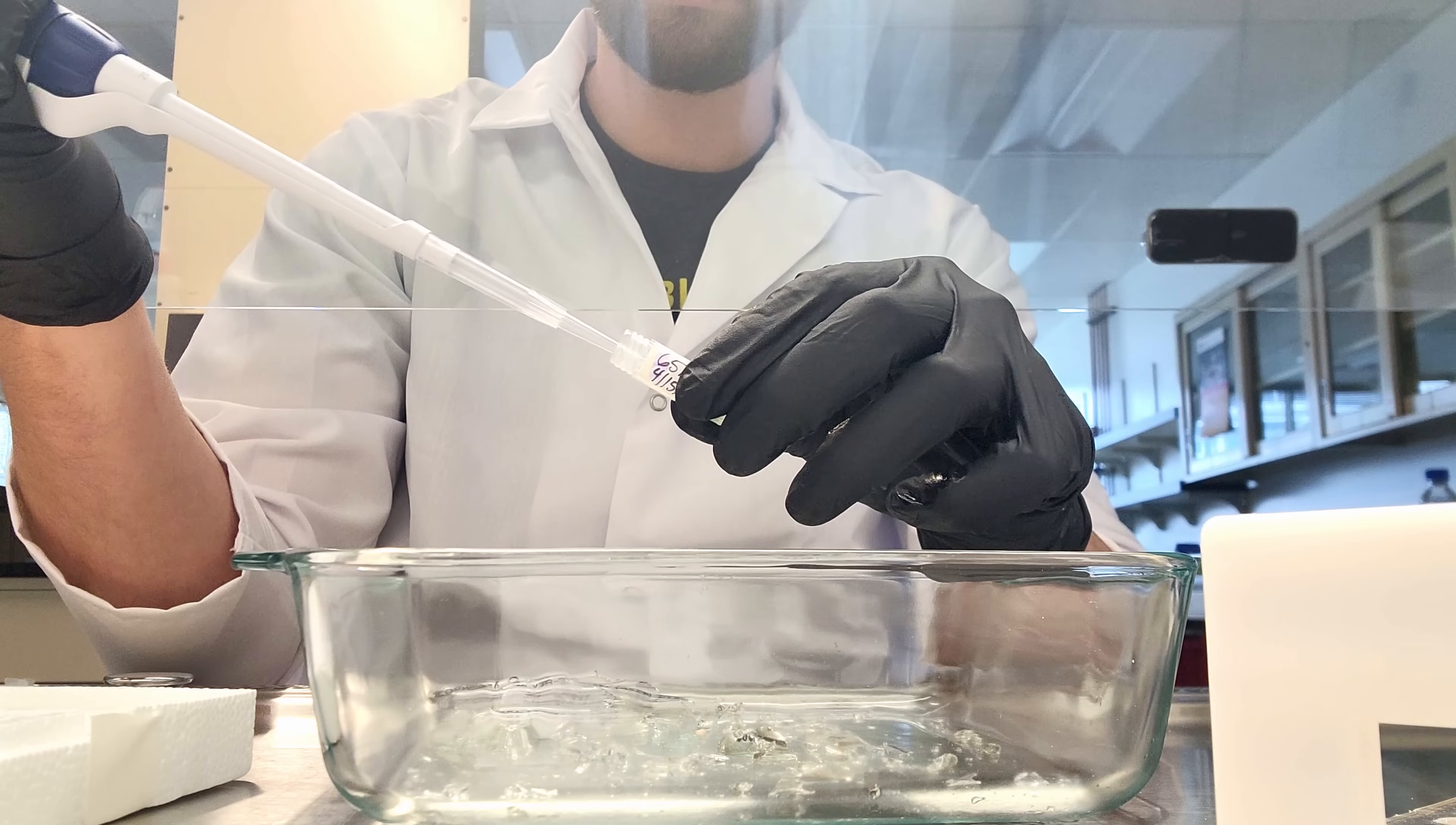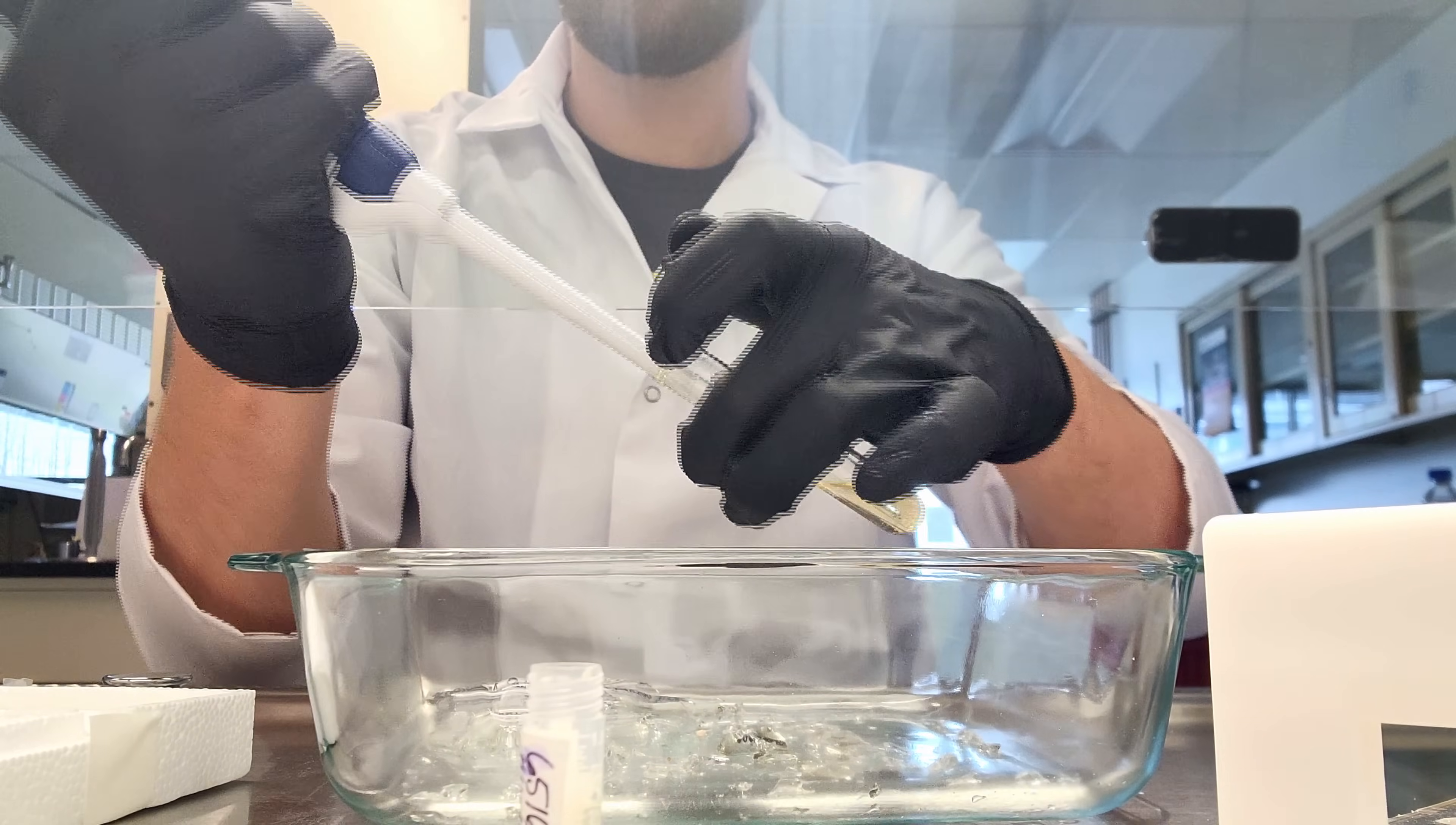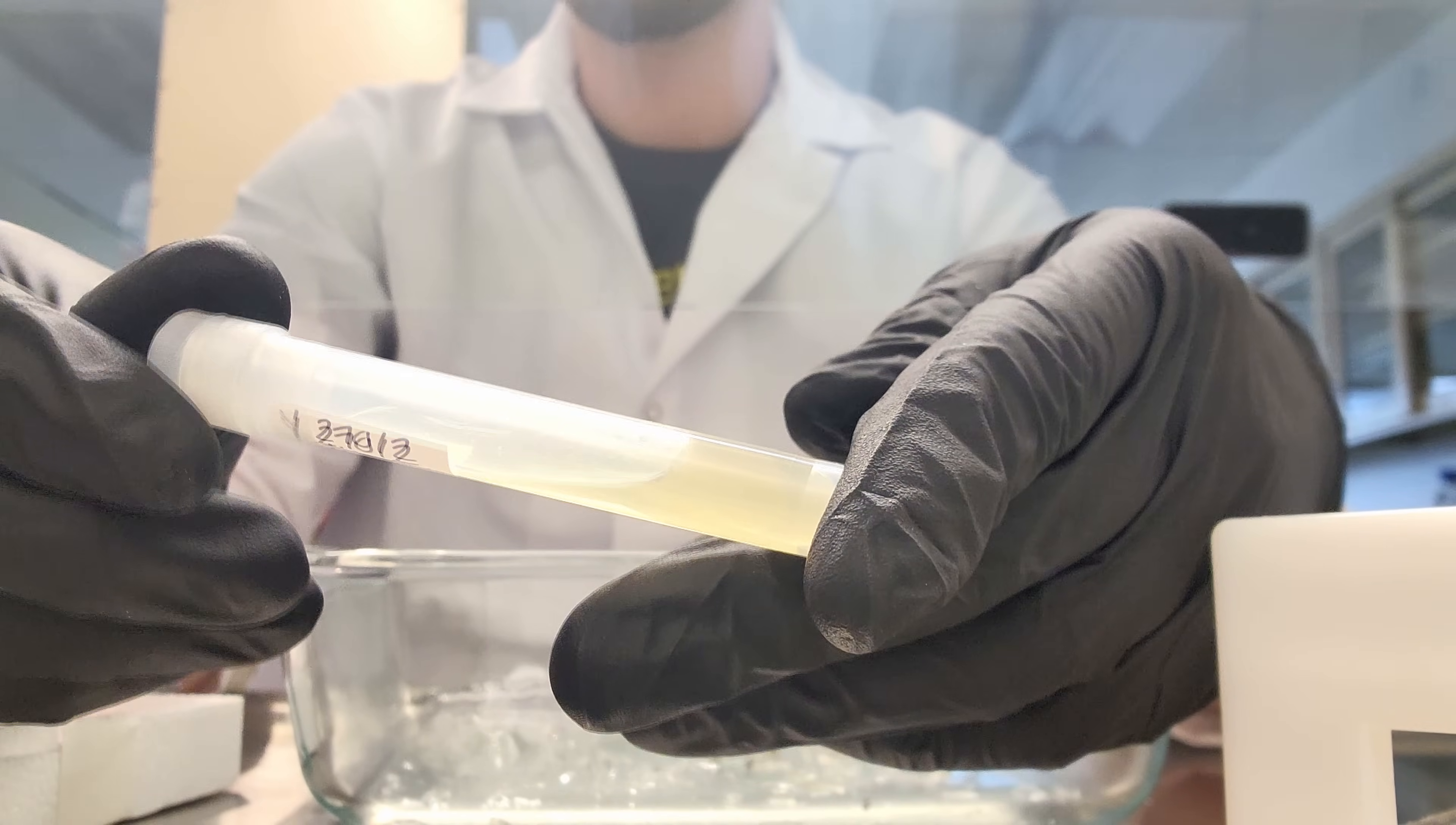In this case I'm taking a volume of this glycerol stock, something like 50 to 100 microliters, and resuspending it directly in that YPD liquid culture just to make sure we get some cells in there. Sometimes these culture collections have been sitting around for a while, or an intern made the culture, and they may not be viable. In this case it was a filamentous fungi, so you can see the bits floating around.